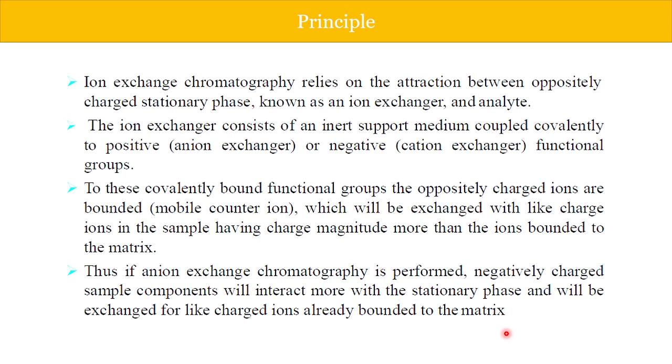Then you can separate them by providing another negatively charged ion which will replace your negatively charged protein, and by this you can separate.